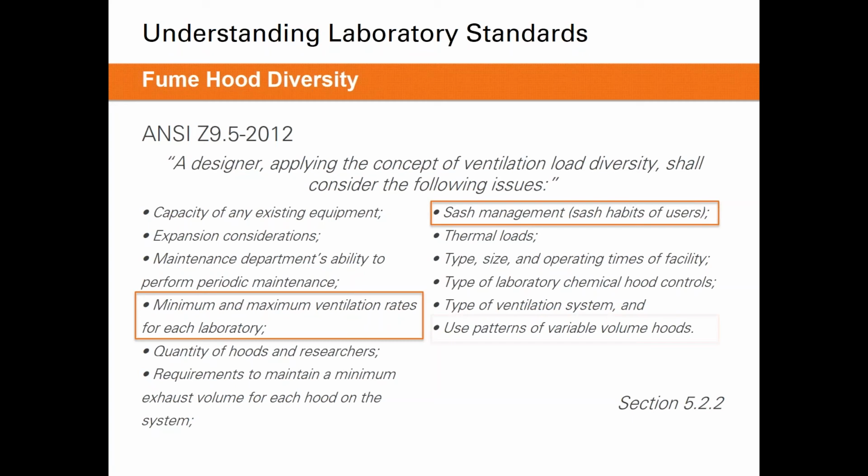The last one would be use patterns of variable volume fume hoods. So are 100% of the fume hoods being used at any given time, or will there be 50% of the fume hoods used only as a maximum?